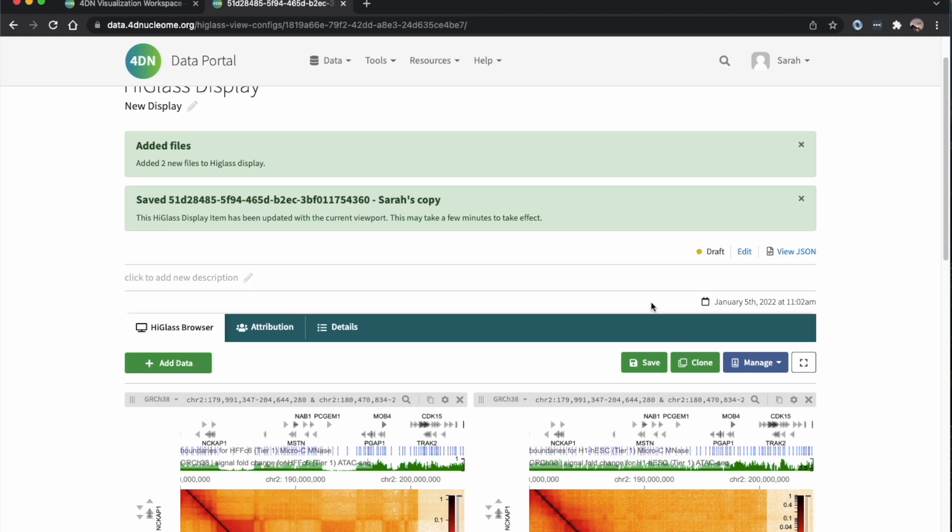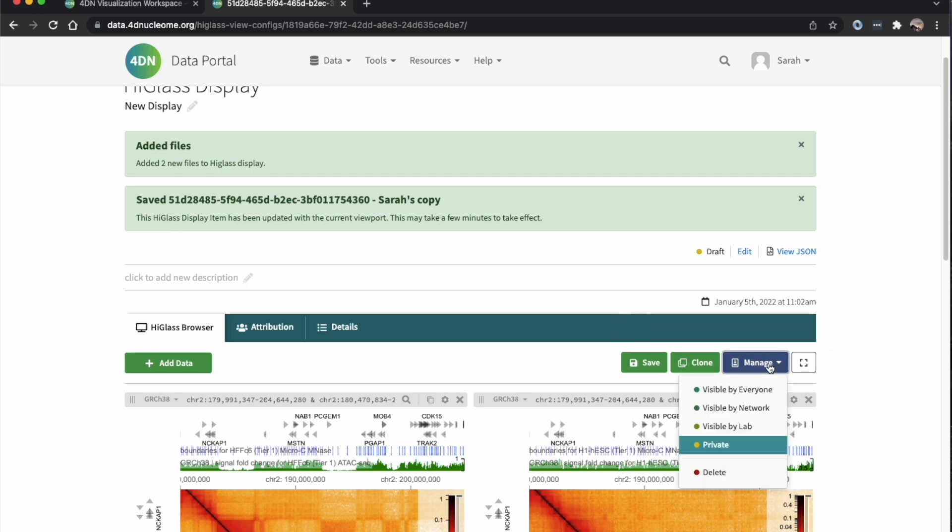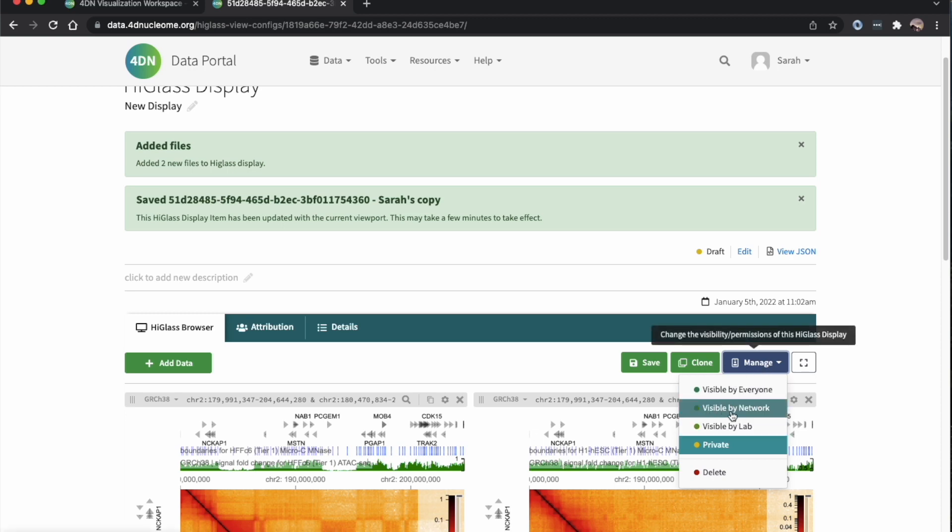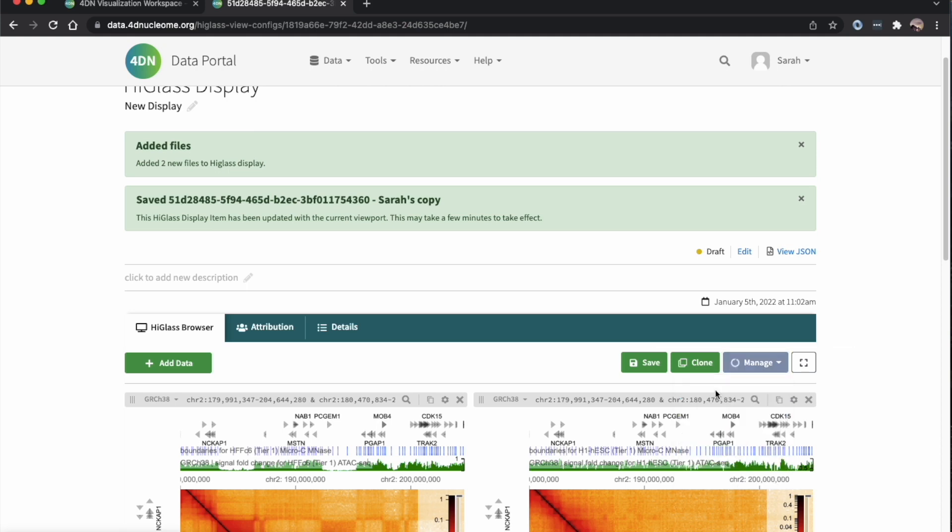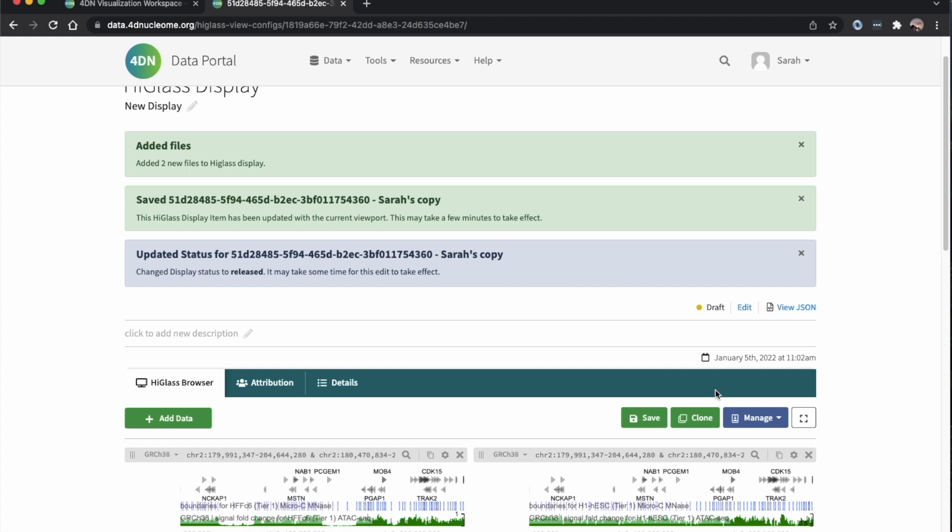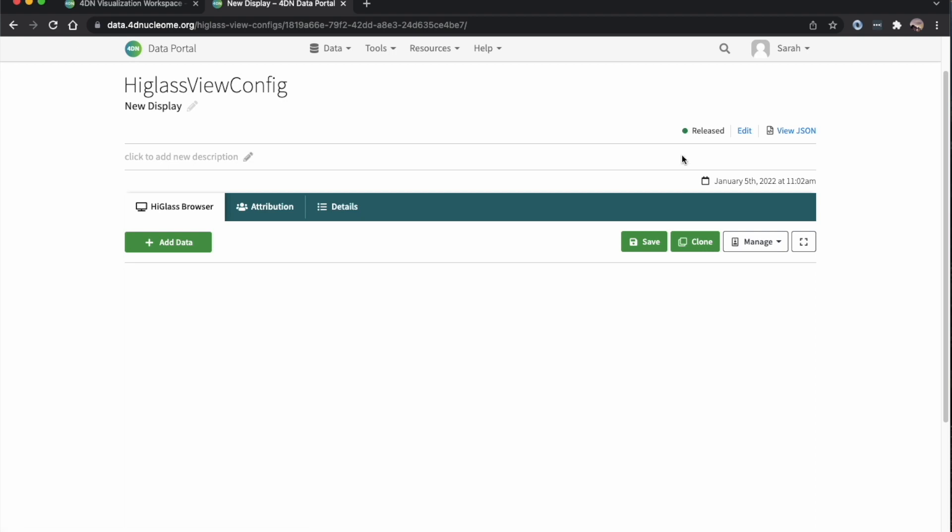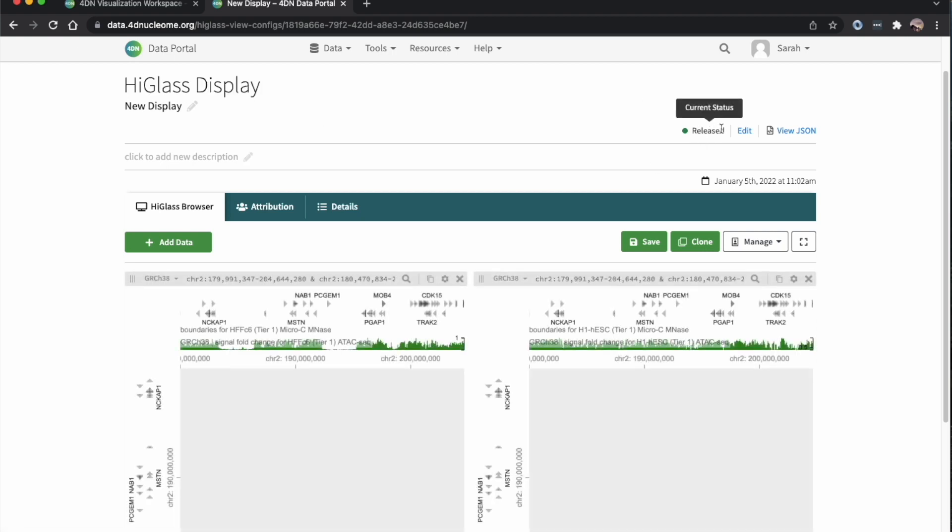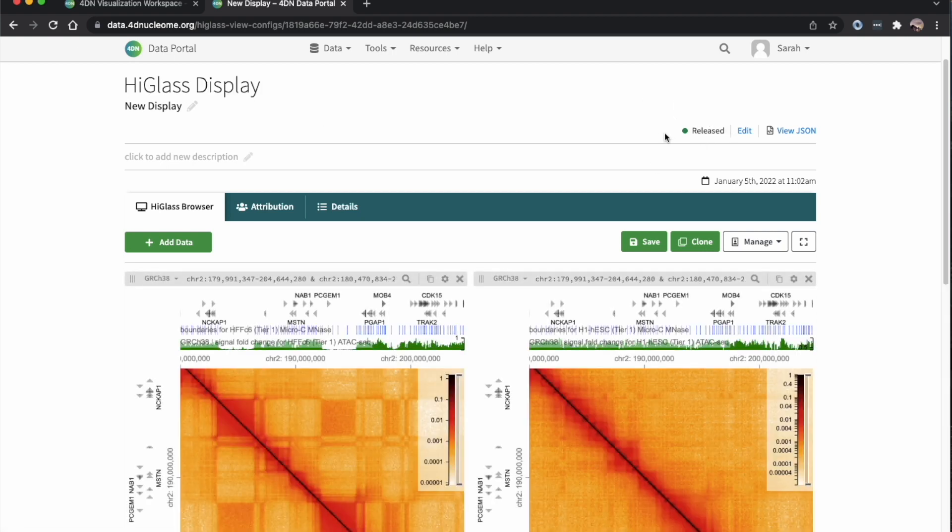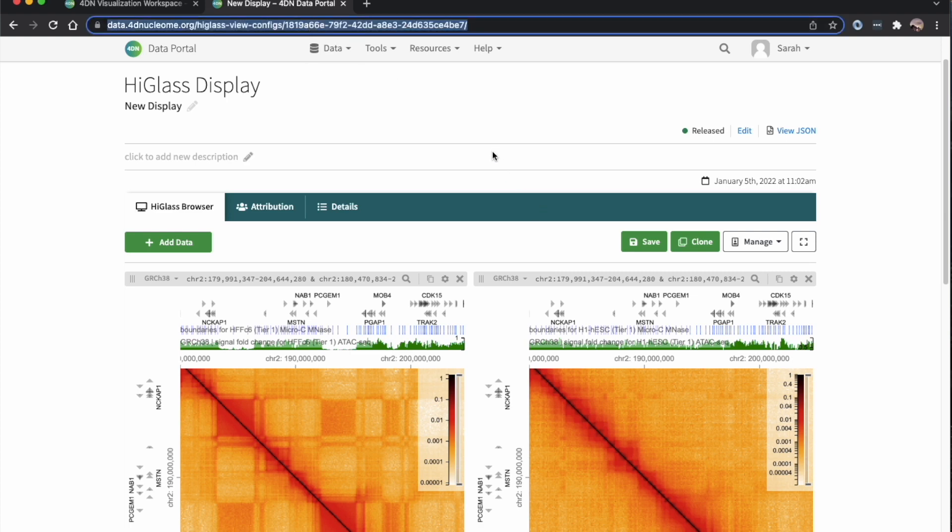Now I can save this display. If I want, I can change the permissions so I can share it with other people in my lab or other 4DN members, if I'm a 4DN member, or I can make it publicly shareable. I'll just reload it to make sure it's released and publicly available. Then if I want, I can copy this link and share it to others.